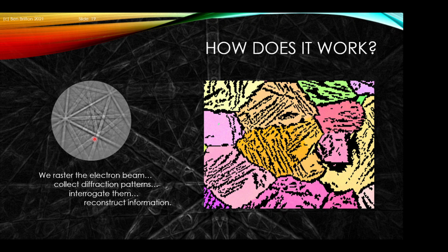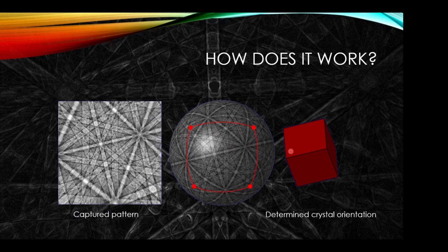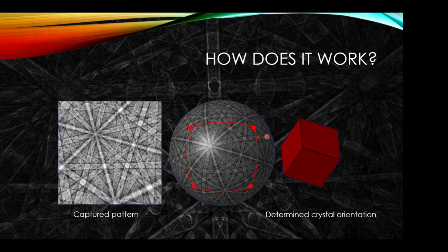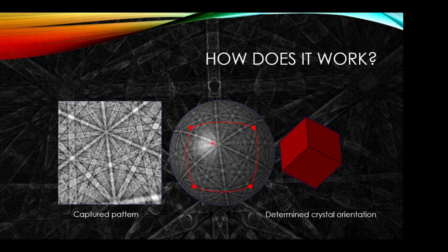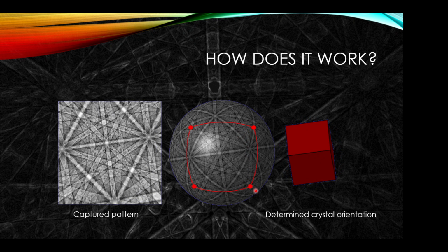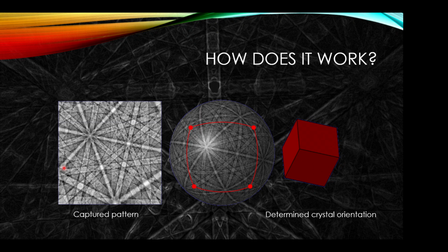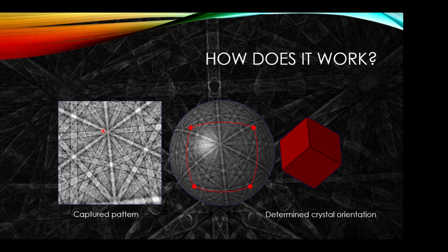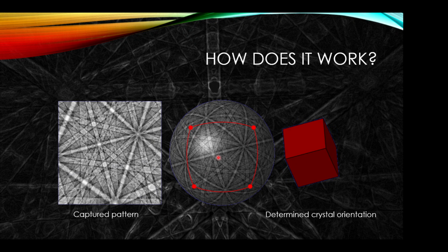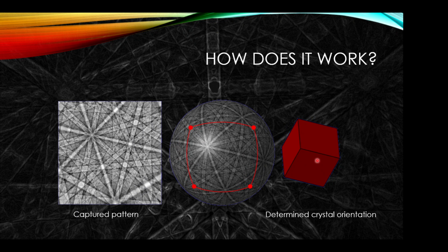Now, if we consider what happens in the experiment, broadly, if we have a crystal that's rotating, the crystal will generate a diffraction pattern, and here is a rendering of a spherical diffraction pattern. We insert a detector that measures this diffraction pattern, and we effectively capture it. So if we can measure features in this diffraction pattern, we can relate that back to the geometry of the system and to the input crystallographic orientation and/or crystal phase.